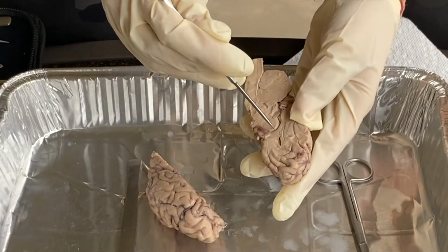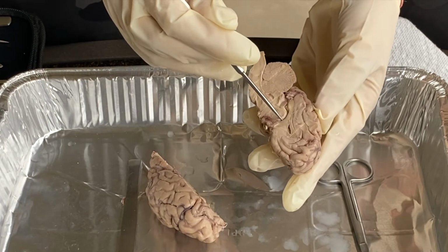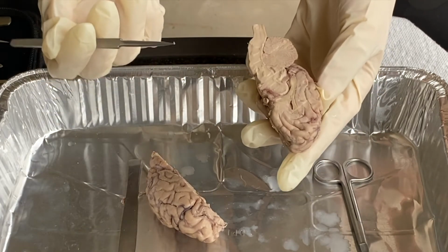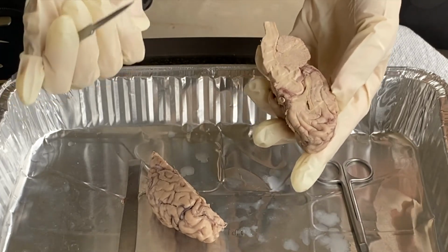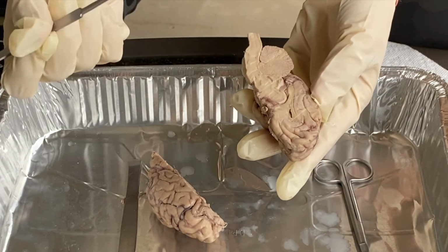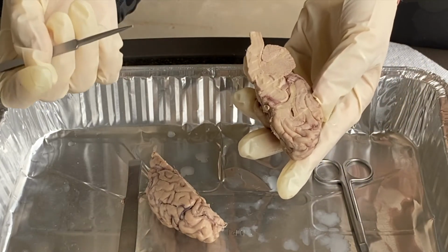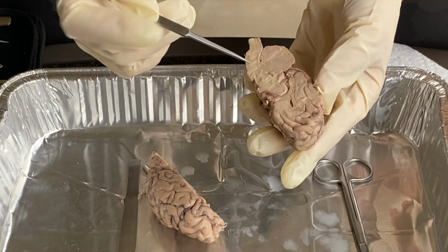So this space right here is your third ventricle, and the third ventricle is one of the 4 ventricles that are present in the brain, and it communicates with the other ones. It contains your choroid plexus cells that are responsible for producing the cerebrospinal fluid that helps protect the brain from injury, and it also transports nutrients and wastes for the brain.